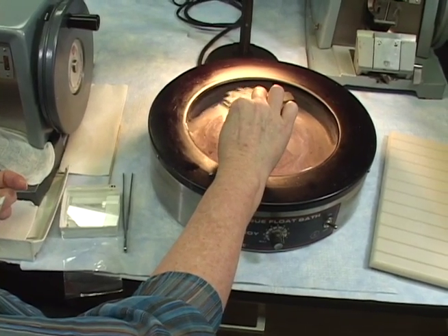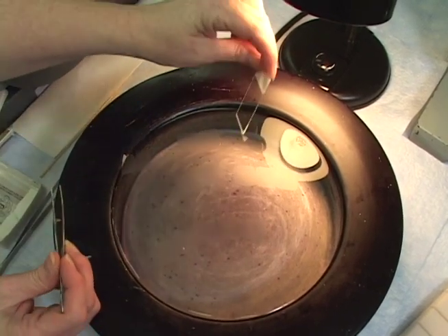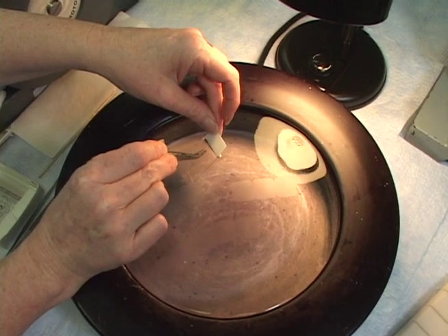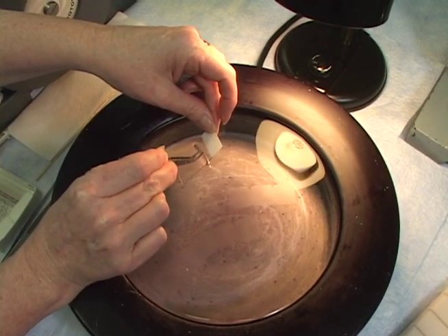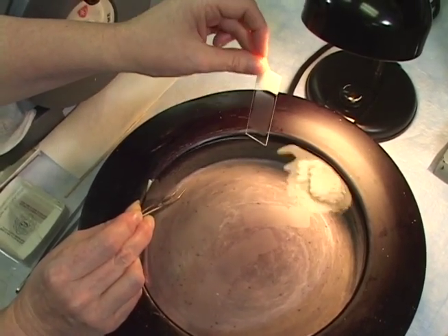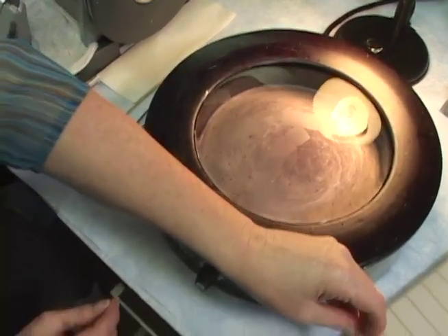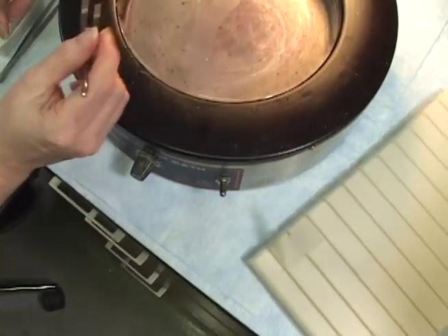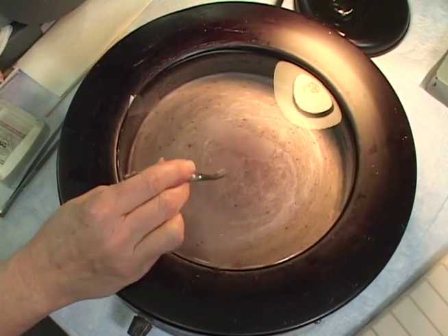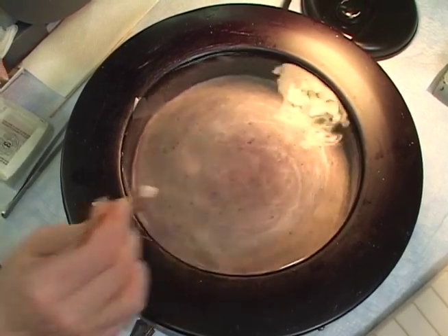Let's say I want 2 sections per slide. I might break it like that. And then I'll take the slide in, and I'll steer it slightly with light touches, and I'll hold it on the very top edge so it doesn't slide down, and I'll lift up and pick up the ribbon. Now if you watch closely, you should be able to pick up these ribbons in an exact order. Of course, this was the first ribbon I cut, but I'm not fooling with that, so we'll say that's just a bad ribbon and get rid of it.